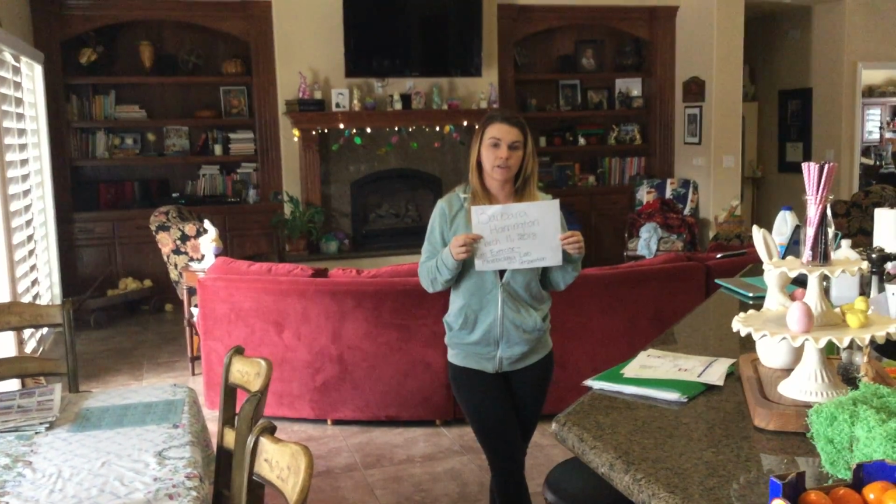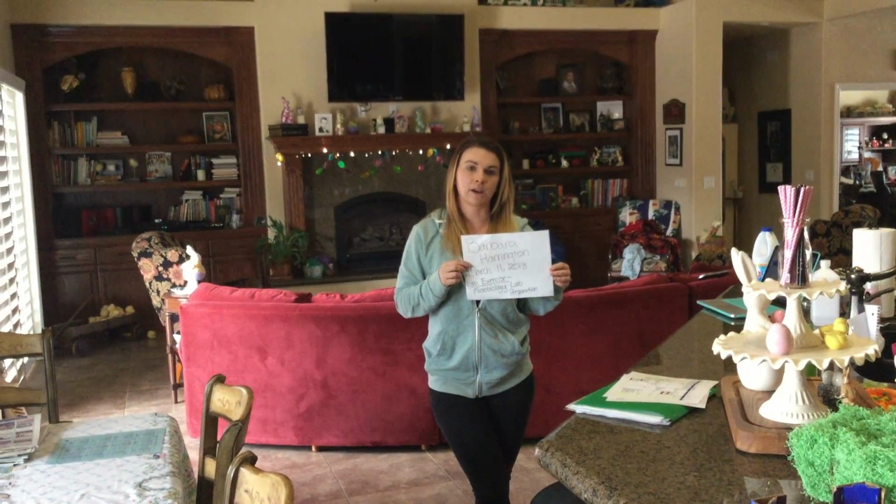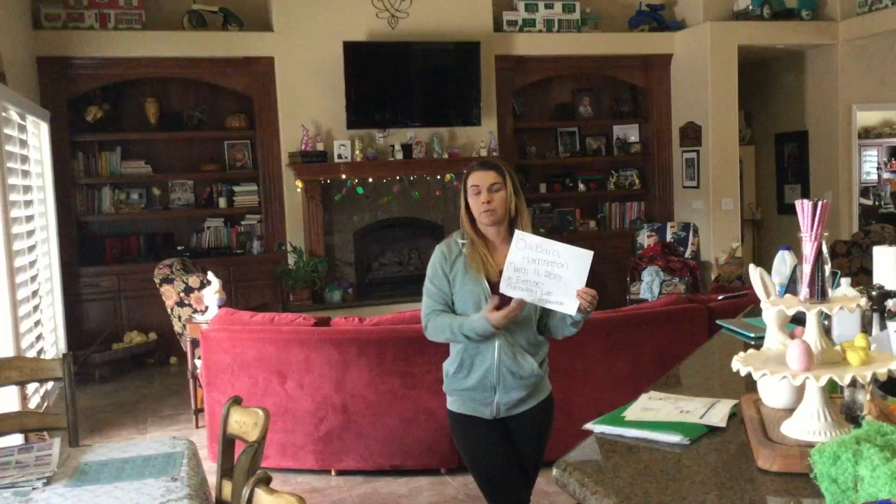Today's date is March 11th, 2018, and this is week 1 of General Microbiology Lab, and we're just going over how we're going to prepare for our future labs.